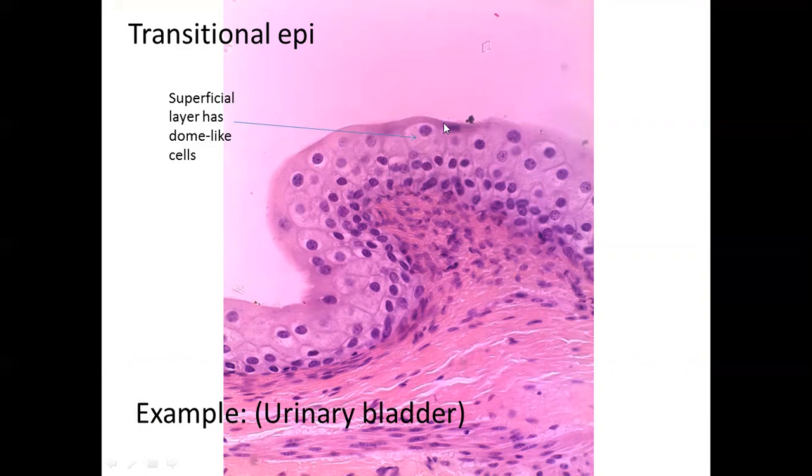The superficial layer has large cells. With this slide, do not confuse it with simple cuboidal. Usually students confuse this slide with simple cuboidal.